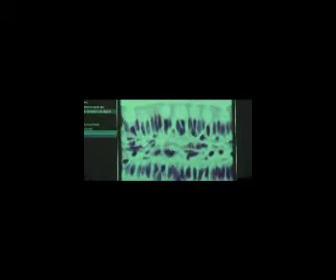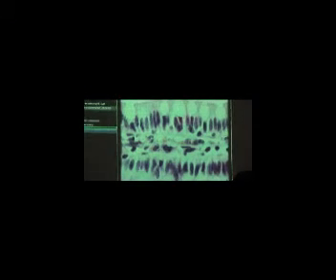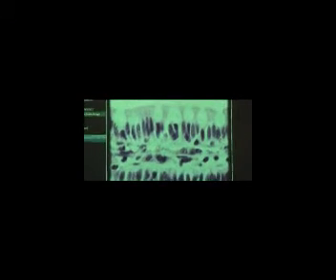Courtney? Caitlin? What are we looking at? Columnar cells. What type of cell is that? Cell type: pseudostratified. Columnar. Cell arrangement: simple.